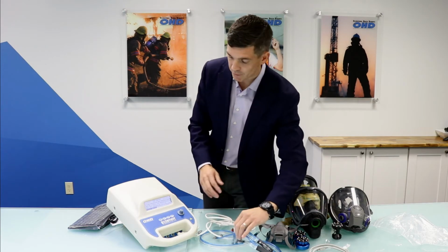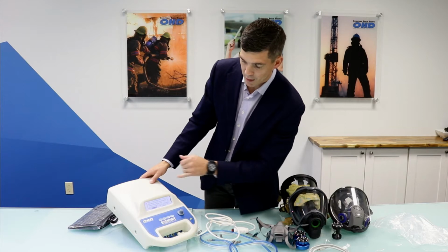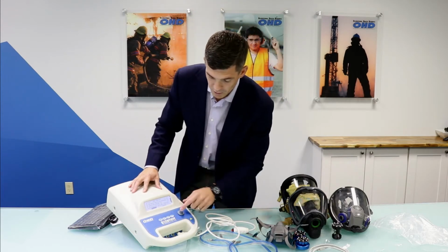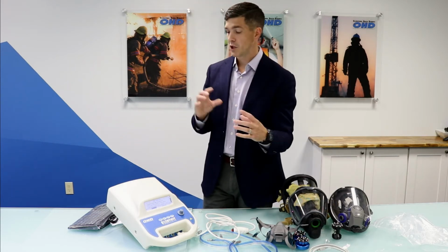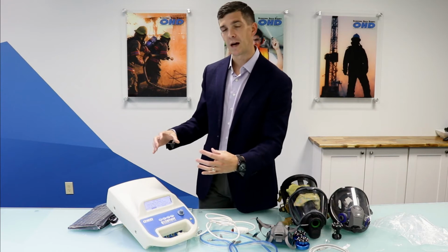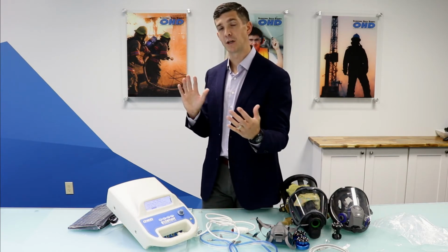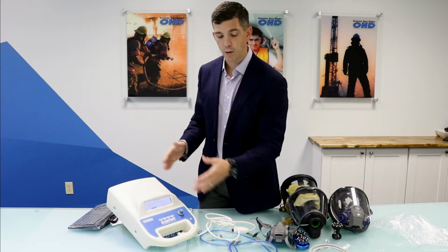So daily calibration, very simple. I'll just hit perform calibration with my knob there, and it says the sensor must be 0 before we start the test. So what I'll do is hit proceed. That zeroes out the tube. Just for this training video, there's a tube inside, obviously. It's our piston pump where we pull that consistent pressure against the respirator and measure leakage. So that's what we're zeroing out. We're zeroing out that pump.